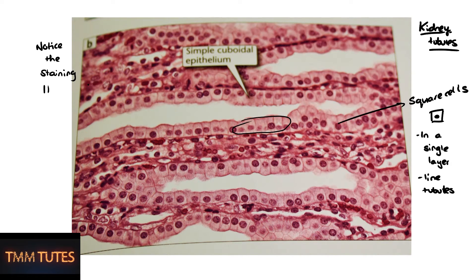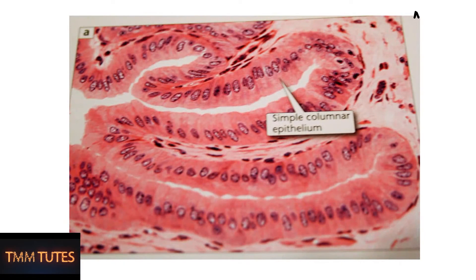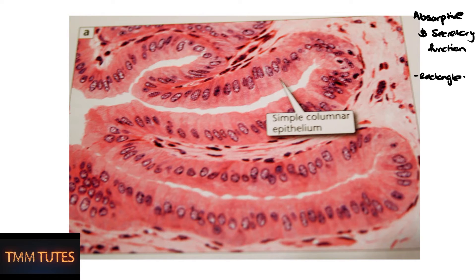Notice that this is a hematoxylin and eosin stain, or H&E. The hematoxylin is purple and stains the nucleus, and the eosin is a pinker color and stains the proteins in the cytoplasm. That applies to all the pictures.